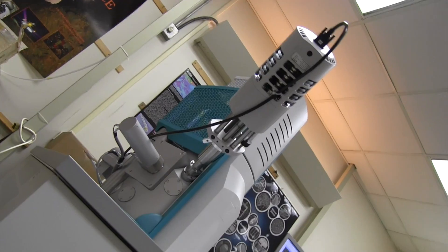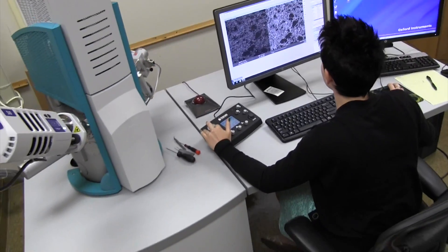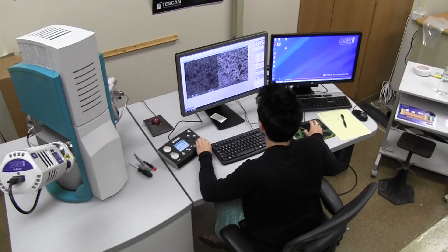This is our SEM — it's a scanning electron microscope. It's similar to an optical microscope in that we use it to look at images at high magnification. But unlike an optical scope, which uses light to view images, we use a beam of electrons, and this lets us look at much higher magnifications.